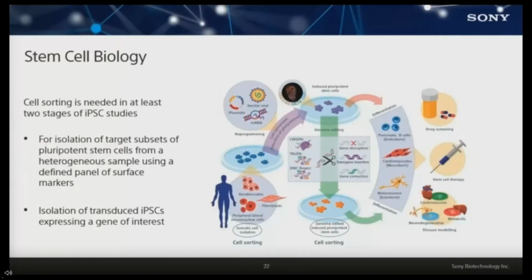So initially, you isolate targets of interest from a tissue. You then sort those cells and plate them out. You may drive differentiation. You may purify those cells. And then maybe after some workflow, maybe you're going to engineer those cells, right? You're going to get them to become something else.